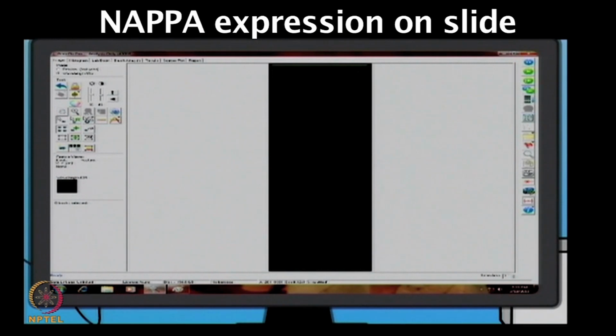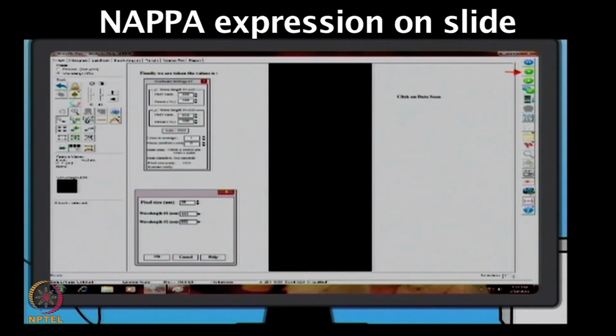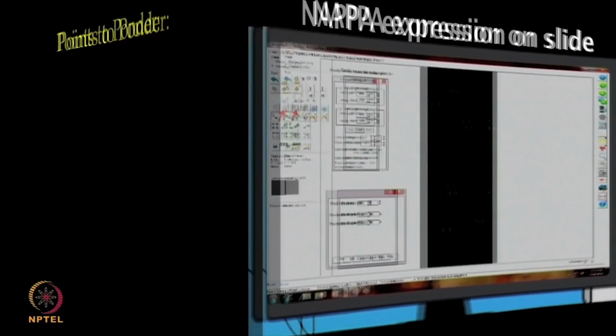First, you can preview the scan, and then you can adjust different types of settings to see the signals better. Then you can look at each region in the zoomed in view and look for the signal.